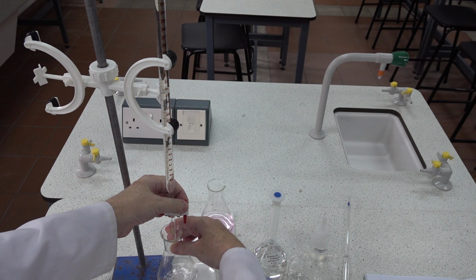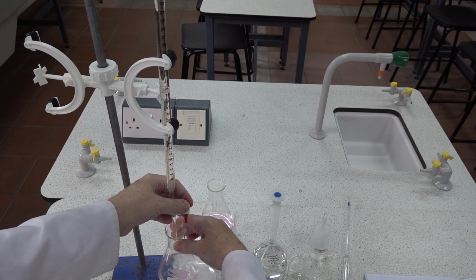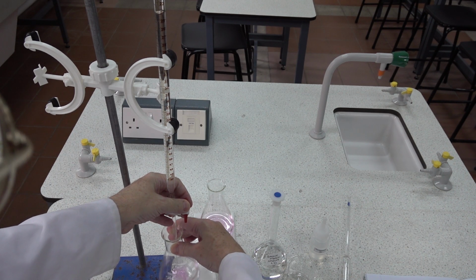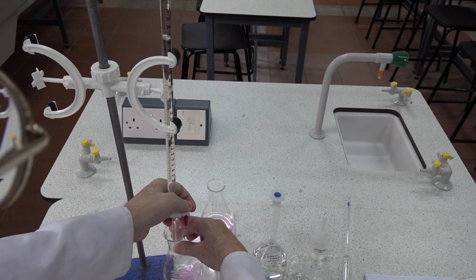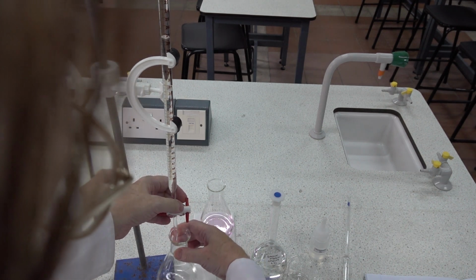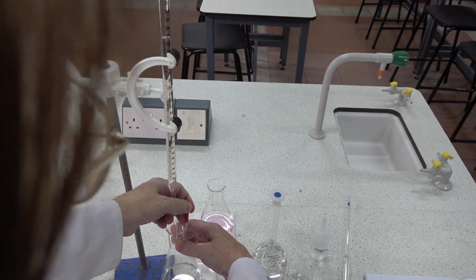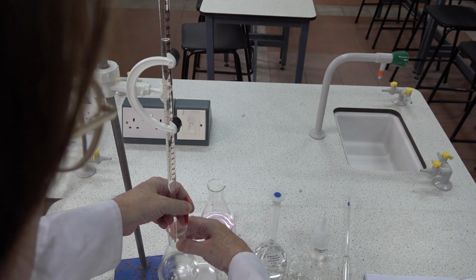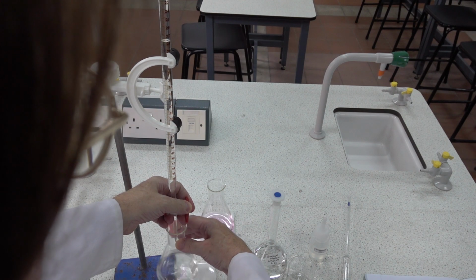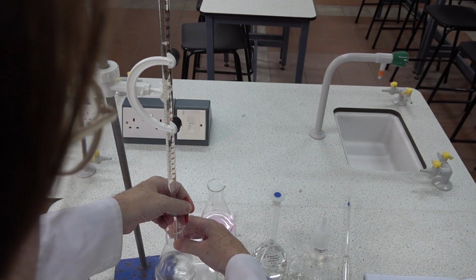So the idea is that by running down to 27.2, we expect to be within 1 centimeter cubed of the end point of the titration, as determined by our first rangefinder titration. So we're coming up to 27.2 now, and it's there. And if we swirl the flask, indeed the colour disappears. And now the point is to add the alkali from the burette dropwise, slowly, and we keep adding until we get that pink colour that persists for at least 30 seconds.